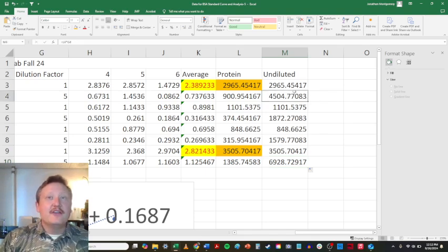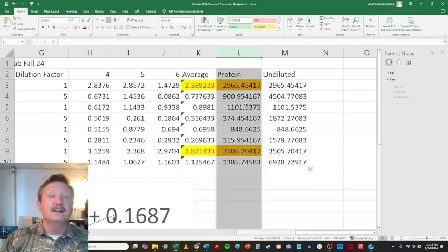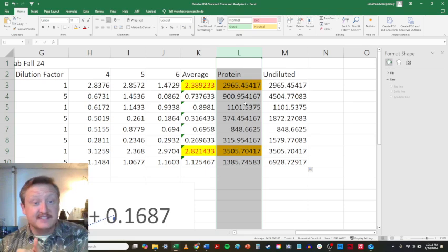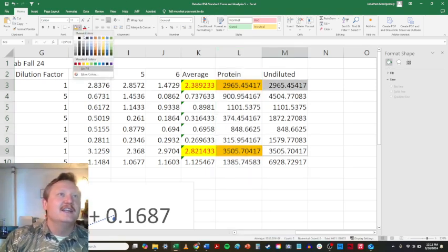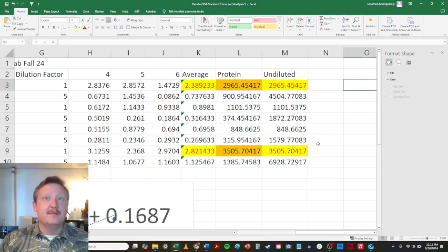All right. Now you're going to see that some of these values are actually higher than our standard curve, but that's okay because the values that we actually measured over here were not outside of our standard curve. We did the same thing with the carbohydrates in the previous lab, right? Same thing. We dilute the sample and then measure and then calculate what the concentration was before the dilution. So we still can't use these two values. Do not use these two values. They're too high, all right? But the rest of this can all be compared.